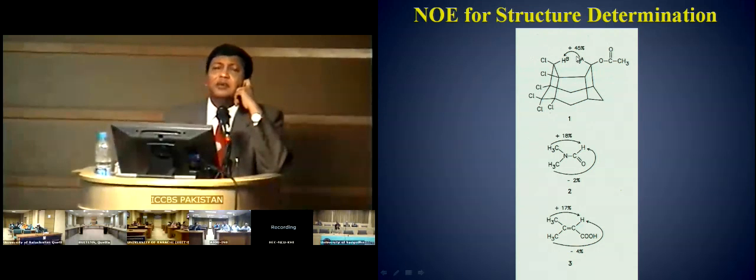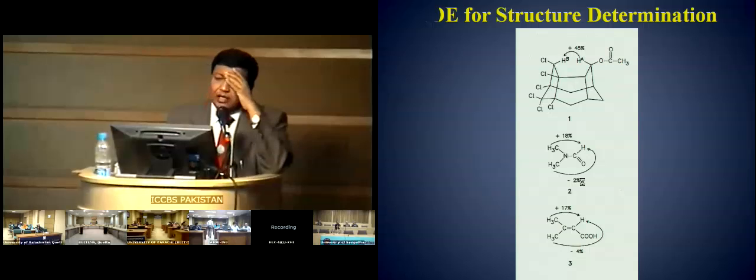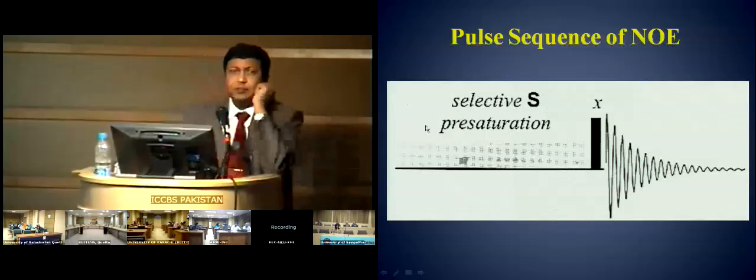Can't do it. Even today, it is a problem. You cannot do it. So unfortunate. Very, very unfortunate. People have been developing lots of conformation models, trying to fit them with the observed data, but it is practically impossible. Pulse sequence, very simple.